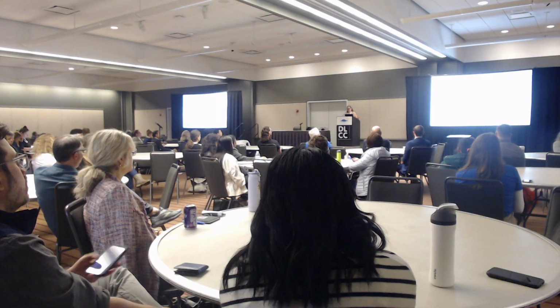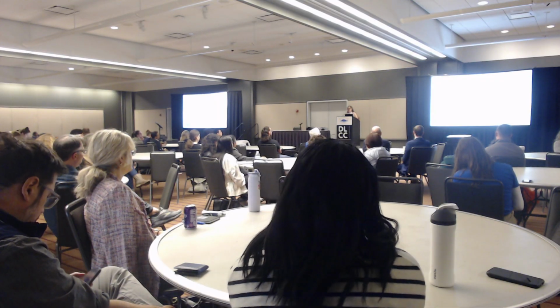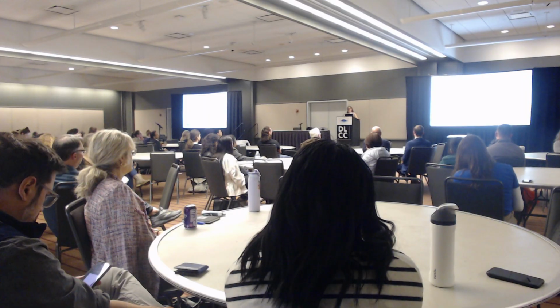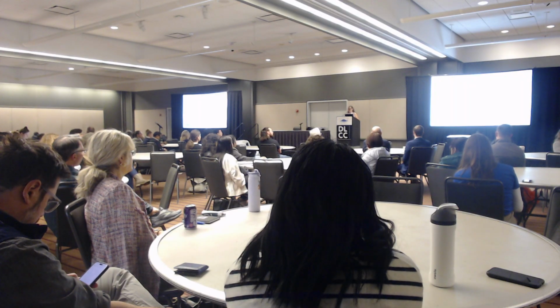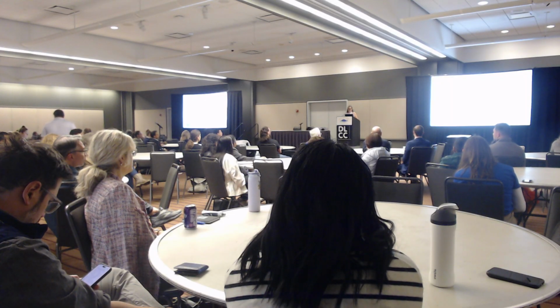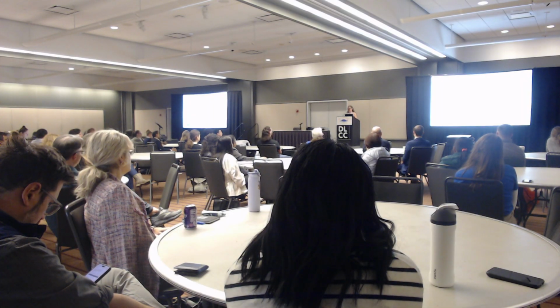So, as I said, I've been running this core. I'm in my 12th year now, and it's interesting because from the beginning, we had a very strong group of researchers from different fields in cancer, developmental biology, environmental epigenomics, and neuroscience that were very interested in having hydroxymethylcytosine measurements, which is not everywhere. That stems from my founding faculty director, who had shown that in AML, hydroxymethylcytosine was very important. Even when she left for Miami, that stayed. So there's always people asking for hydroxymethylcytosine.